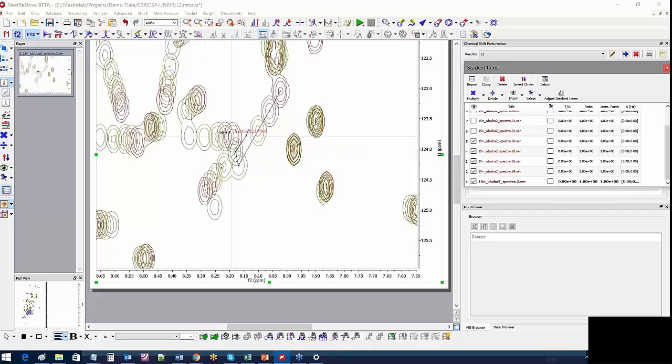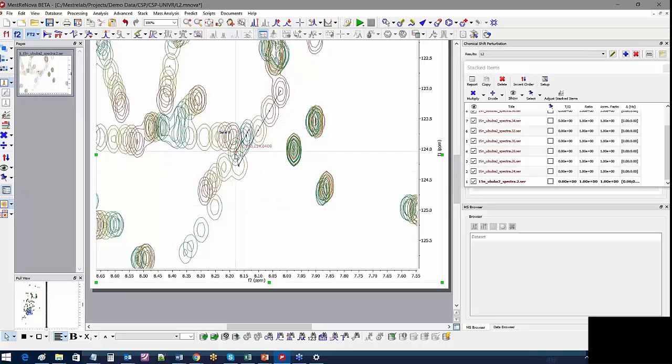That's very helpful. So now I know it should go to here, and I can verify that by looking at the second one. Yeah, apparently goes to here, right? So with that knowledge, definitely we can change the path, such as drag to here, and also that one.